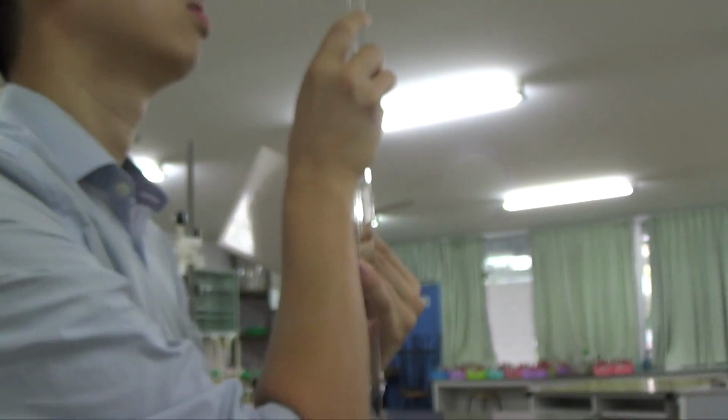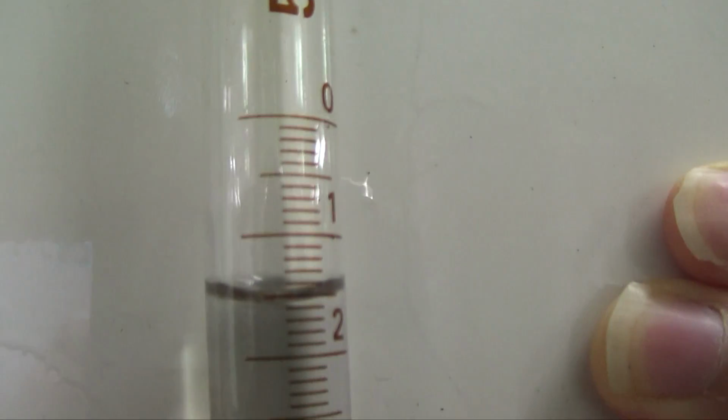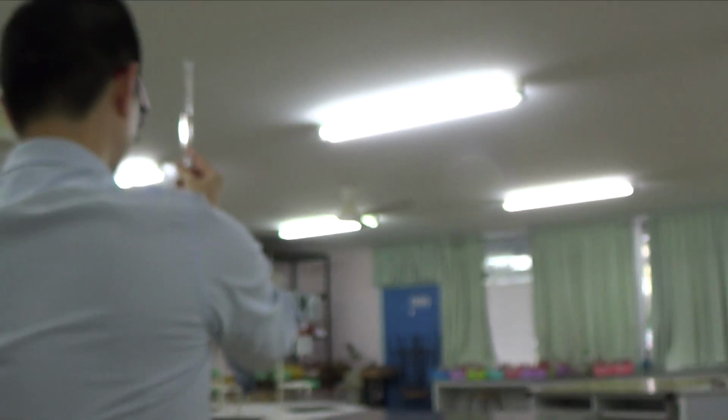So that one again is 1. This is a bit tricky. It's now 1.5 cm cube. Maybe it's 1.5 cm cube then. But this being my first titration, a rough titration shouldn't matter that much. So 1.5 cm cube.